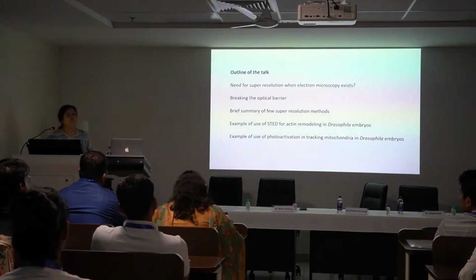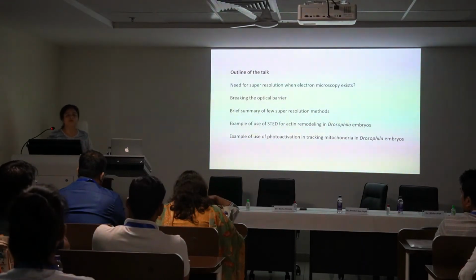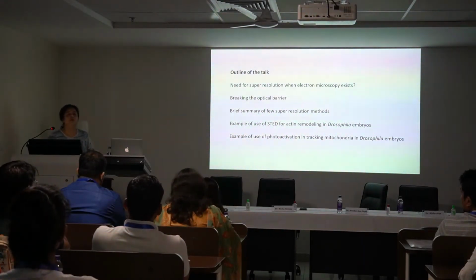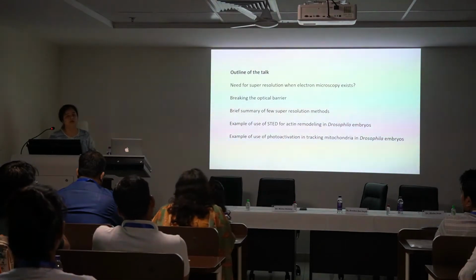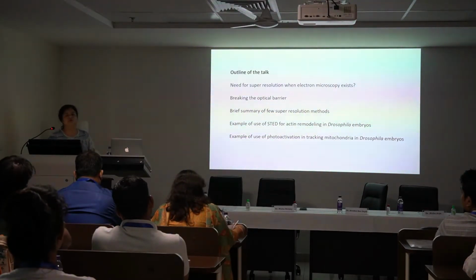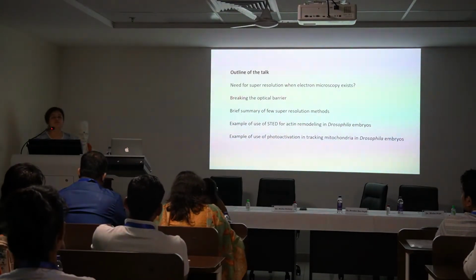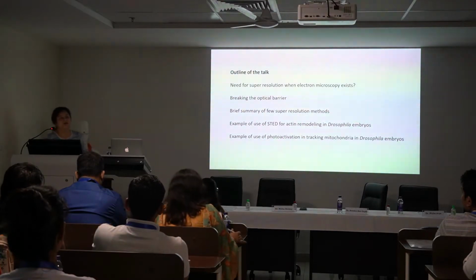So there has been a huge wave of discoveries by scientists to basically improve optical resolution, so that we can look at labeled molecules inside living cells and even fixed cells, right? Fluorescence, since you have gone through a lecture on confocal microscopy, you know is used very predominantly in looking at the distribution of proteins inside cells.